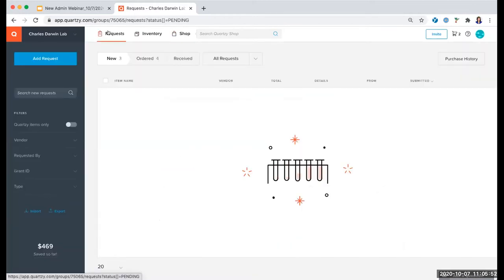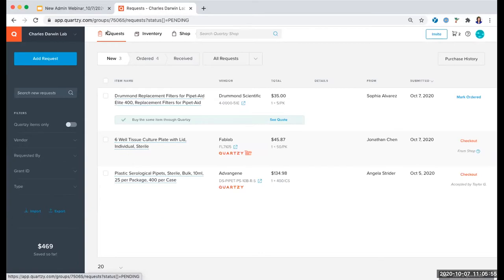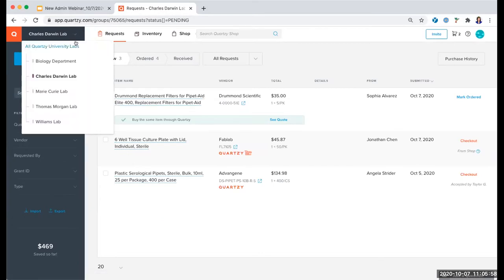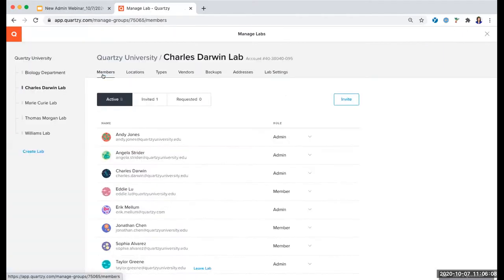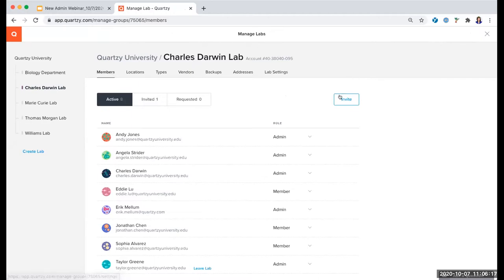We're going to be in the Charles Darwin lab for this demo. Under the lab selection, you're also going to see your lab settings, and that's where we're going to get started today. Click on the gear icon here and that'll take us to the settings for the Charles Darwin lab. This is your Manage Labs page. I start by selecting the lab name on the left and then the Members tab, where you can either invite members into your lab or promote members to administrators. We strongly recommend that in your lab you always have at least two admins so that if one is temporarily out or leaves, there's a backup admin already selected who can take over management responsibilities.